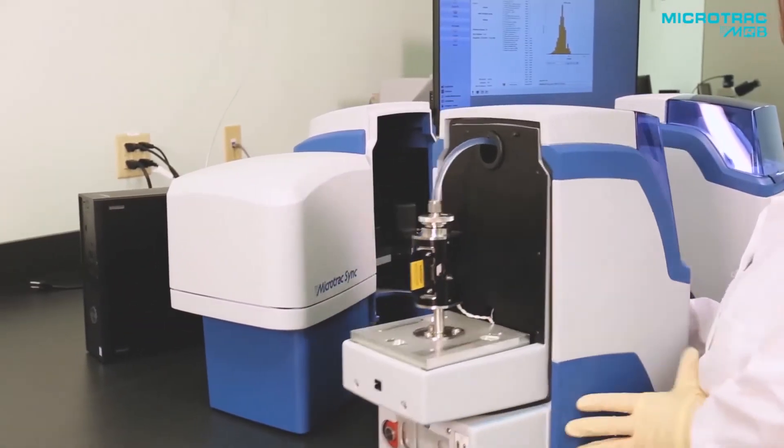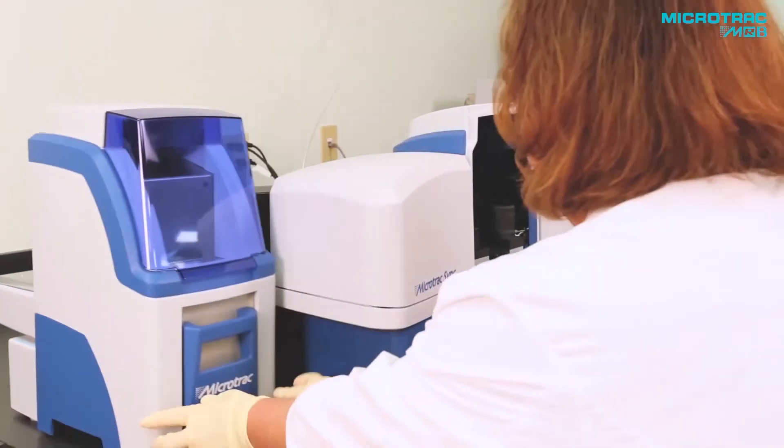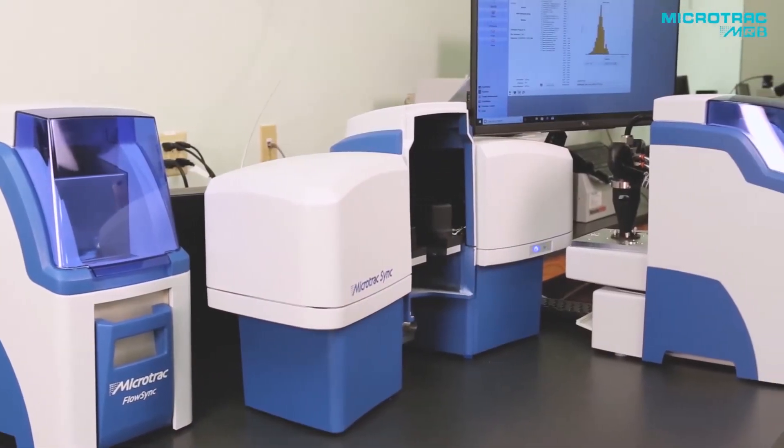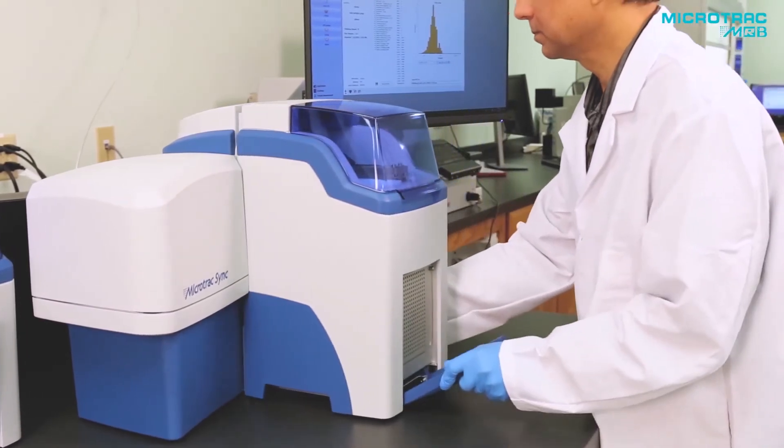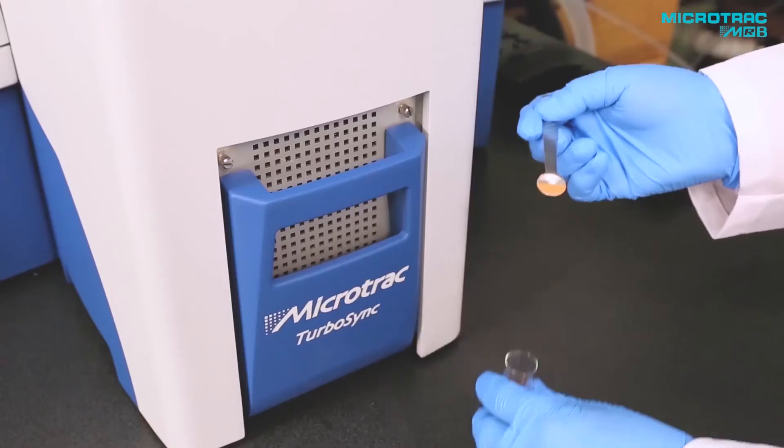Dry measurements are just as easy. Simply disconnect the flow sync and replace it with the turbo sync. All air and fluid couplings are automatic. Now we're ready to run.